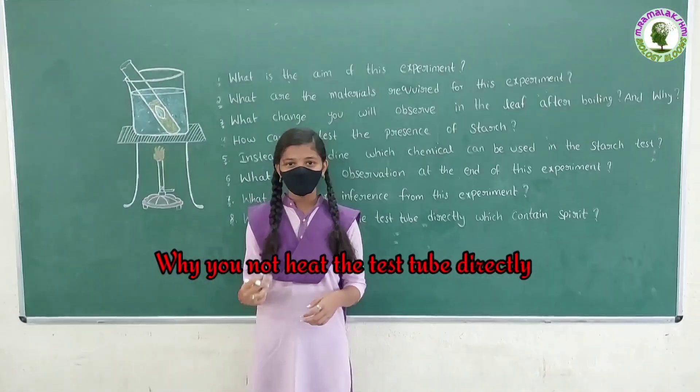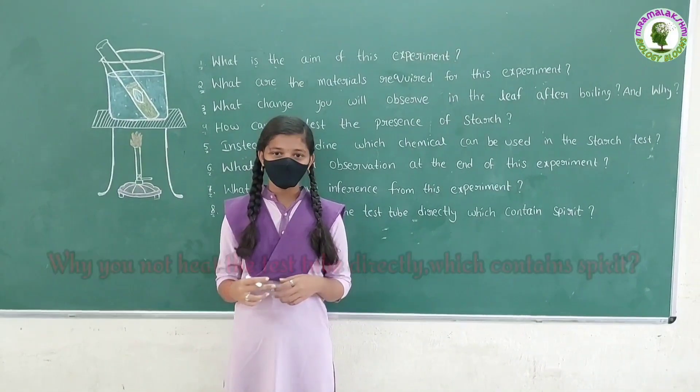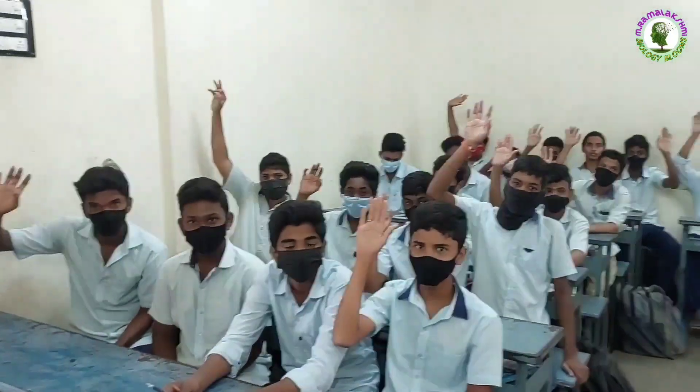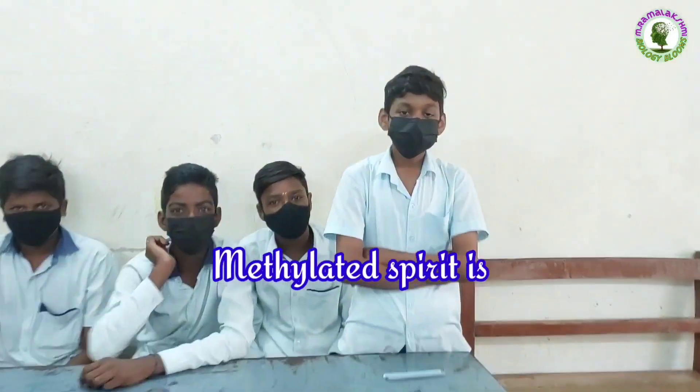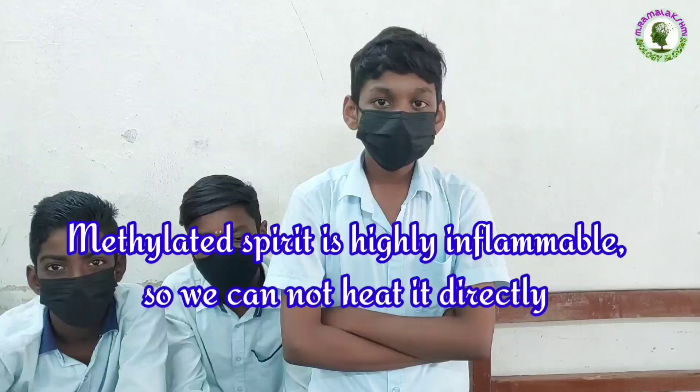Why do you not heat the test tube directly when it contains spirit? Mohan: Methylated spirit is highly inflammable, so we cannot heat it directly.